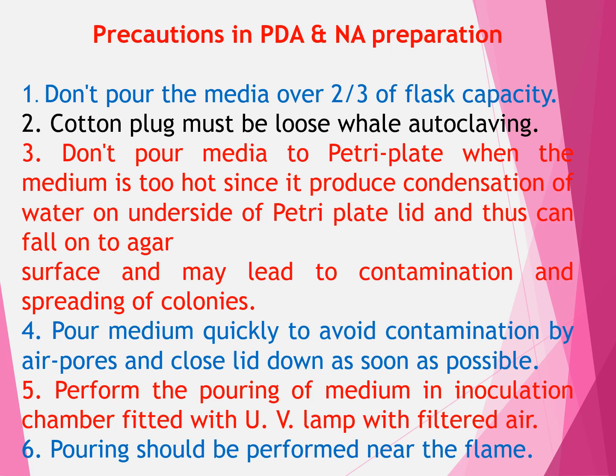Next, don't pour media into the petri plate when the media is too hot, since it produces condensation of water on the petri plate lid, which can fall on the agar surface and may lead to contamination and spreading of colonies. So wait till the media gets lukewarm. A simple method is when you are able to handle the flask easily, at that temperature you can start pouring.